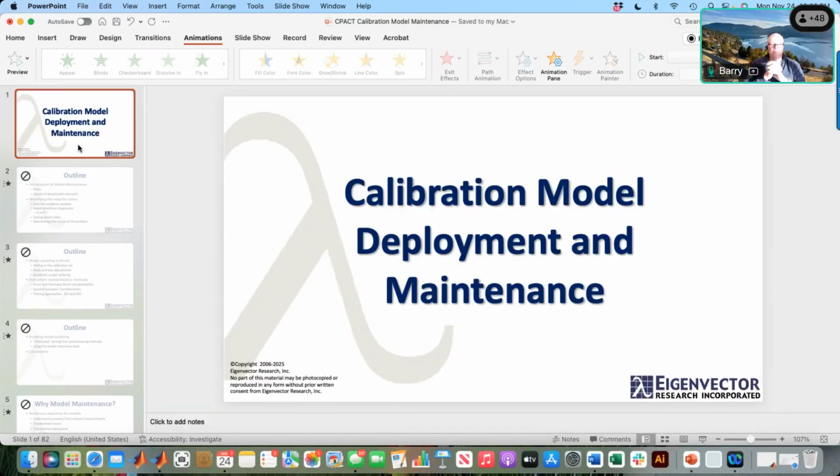Yeah, okay. You can get a relationship change between a sample and its response because the instrument changed. There are also things that can change it, like a change in pH, a pressure change, or a temperature change that affects how your sample appears when you measure it, or sometimes some other kind of matrix change. So that's what I mean: the relationship change between a sample and the measurement that you get.